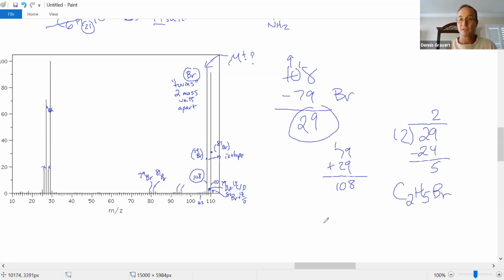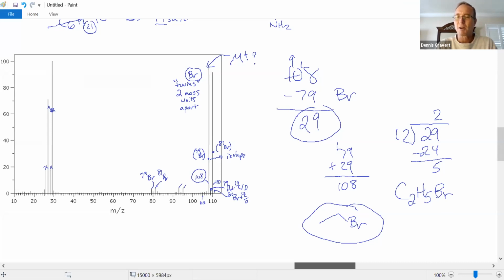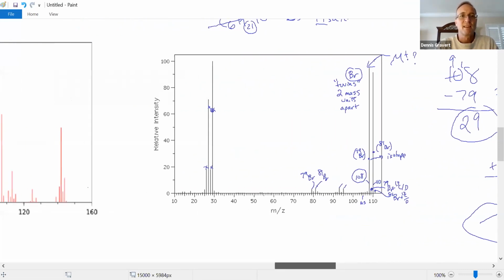Wow. I think we know what the molecule is. It's ethyl bromide. Is there anything else? Nothing else we can draw. Hey, that's cool. That is the answer. Yeah, I can't think of another way. Bromine bonds 1 time. Yeah, beautiful. Didn't need the degrees of unsaturation. It was just such a small molecule, only 2 carbons.